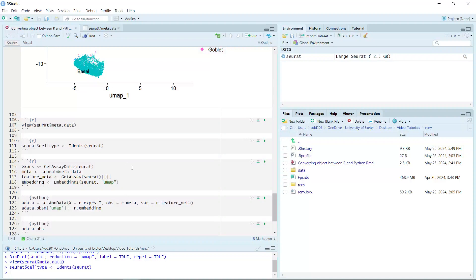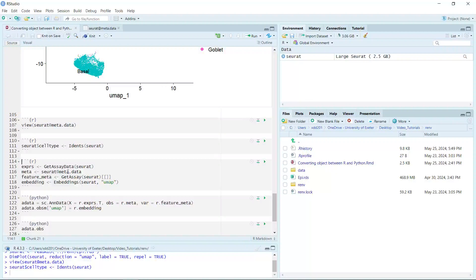Now we prepare the Seurat object to convert into an AnnData object. To convert the Seurat object into an AnnData object, first we can get the expression matrix data using the GetAssayData function. Then we get the metadata from the Seurat object, and we can also use GetAssay to get the feature data. To produce the same UMAP in the AnnData object, we also need the UMAP information from the Seurat object.